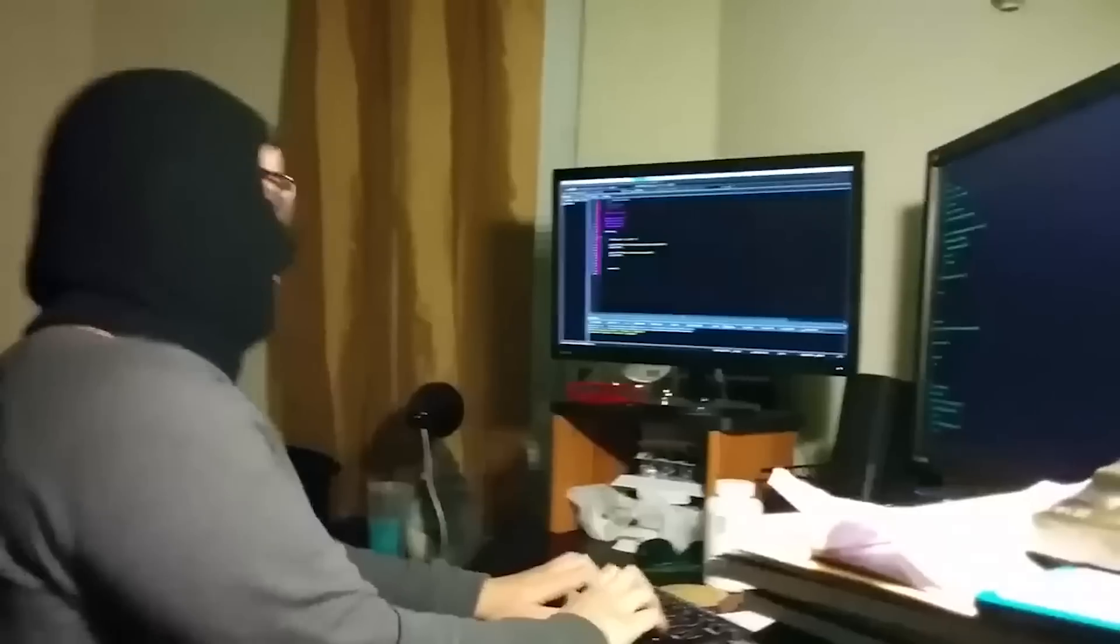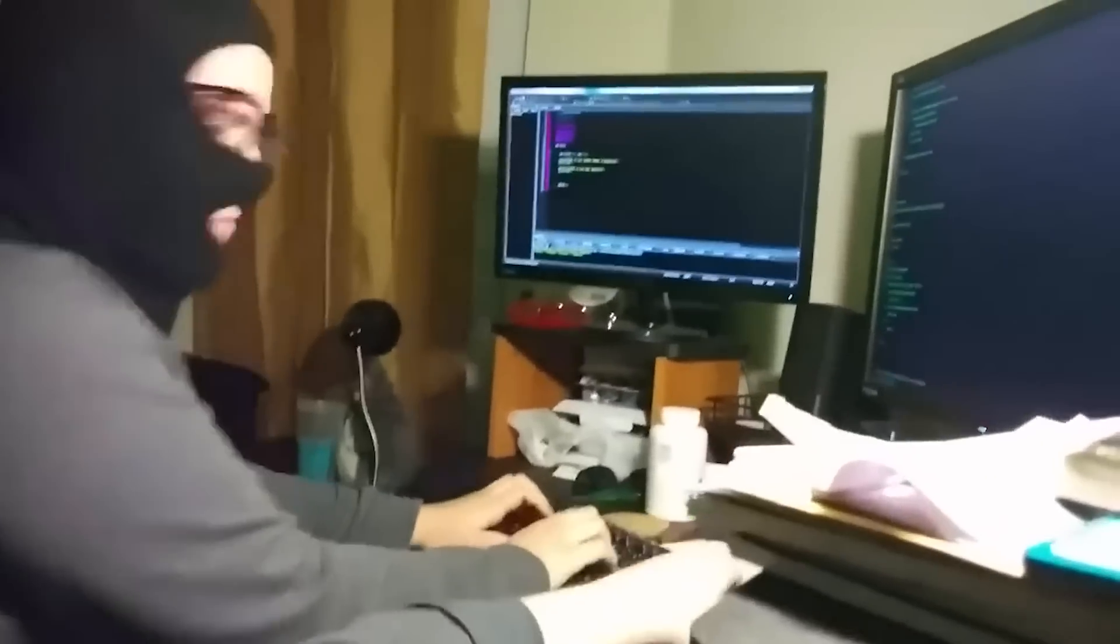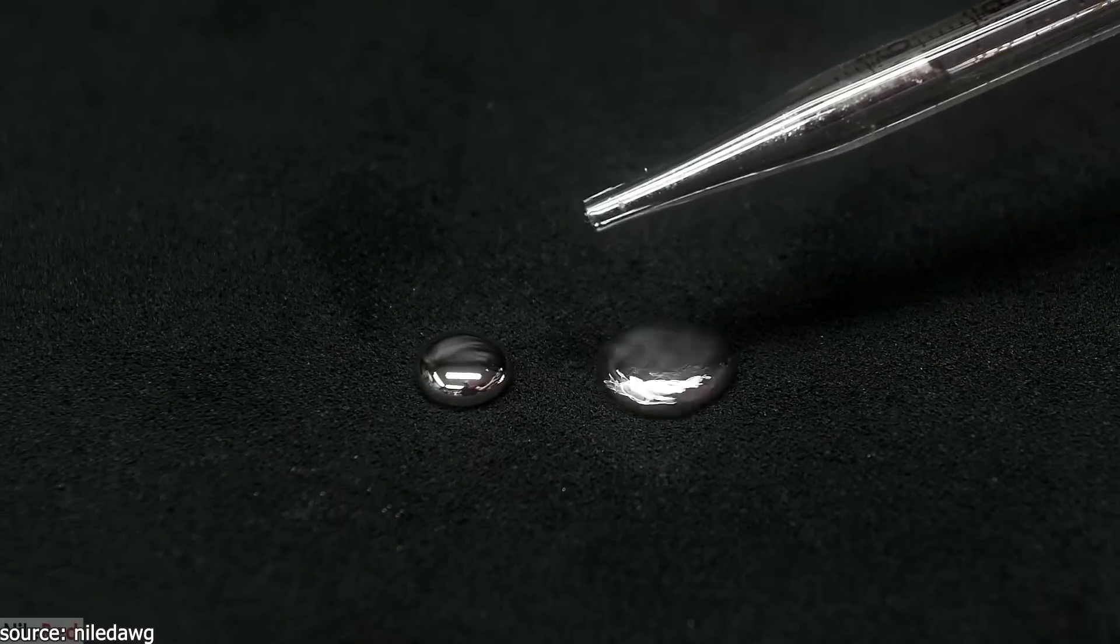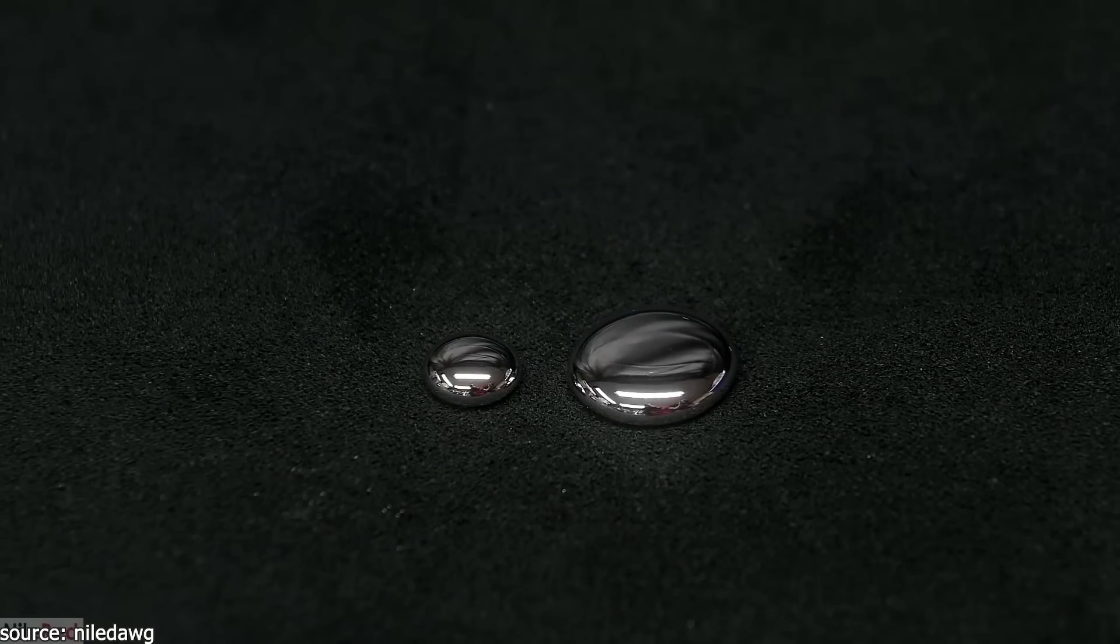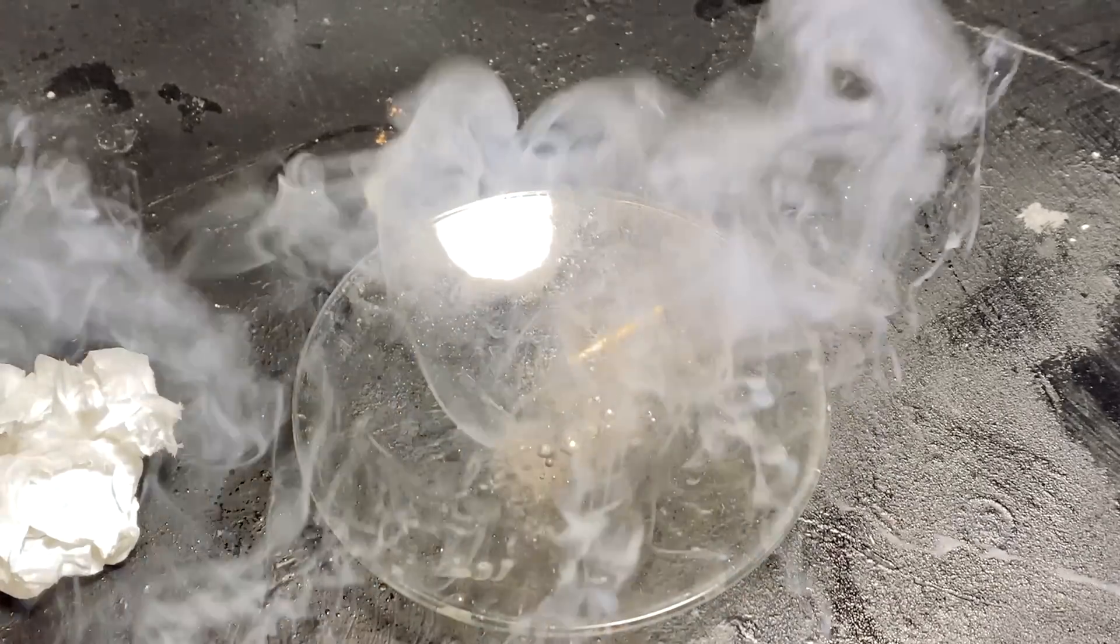Hey guys, your local psyops agent here. Mercury is this cool shiny liquid which can form alloys with most metals to form intermetallic compounds called amalgams, and I'll be demonstrating the more rare and interesting ones I could find.